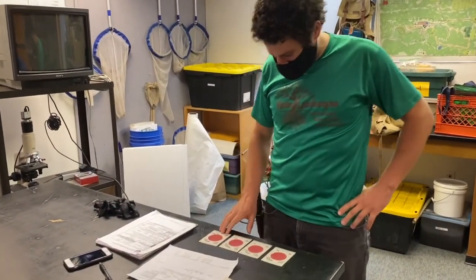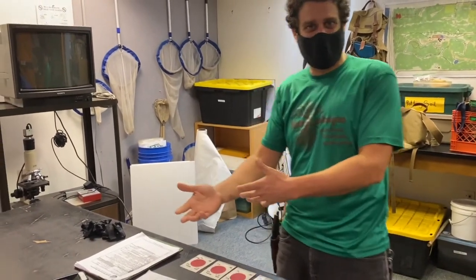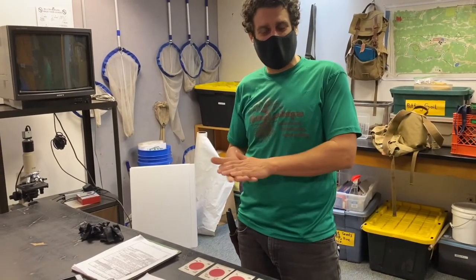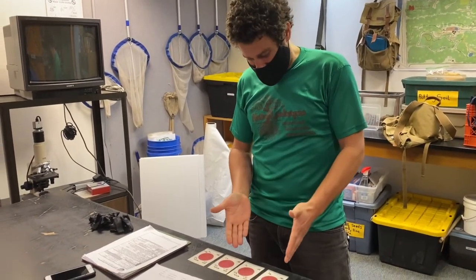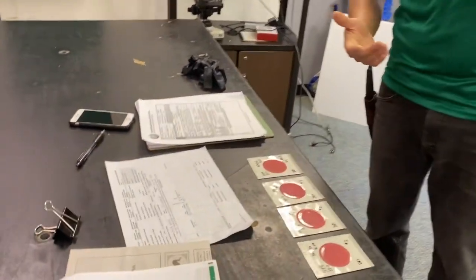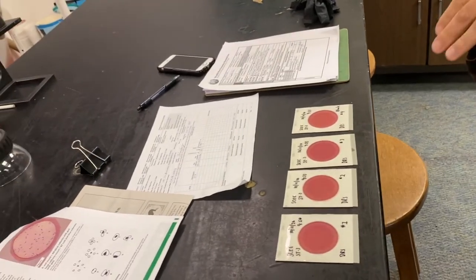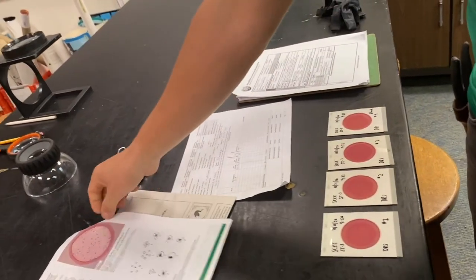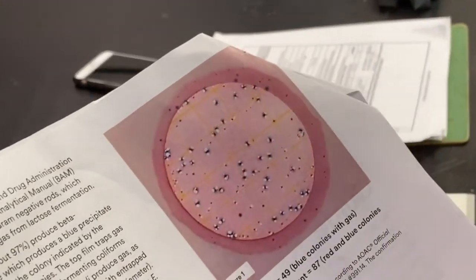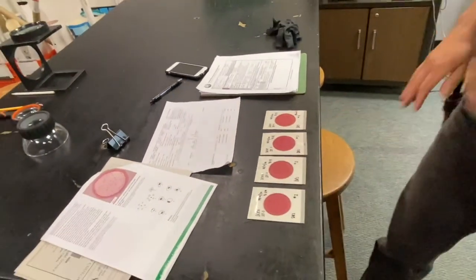It is now the day after — as you can tell, I changed my shirt. After 24 hours of incubation at 95 degrees Fahrenheit, or 35 degrees Celsius, we have our slides to look at. Me and my lab assistant Eduardo Duenas looked this over — basically what we're looking for are blue gas bubbles or blue dots, which signify E. coli. They have gas bubbles around them, and we were not able to find any blue.